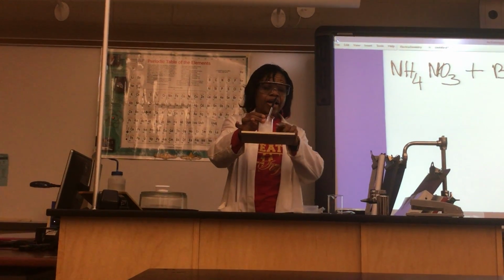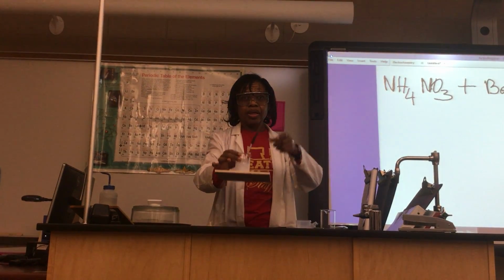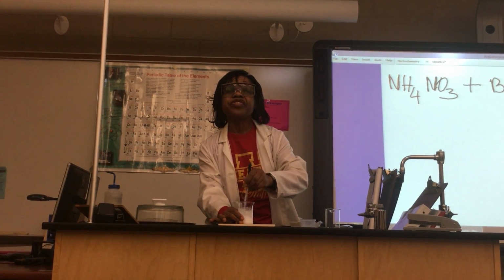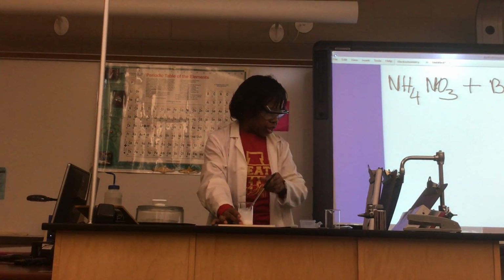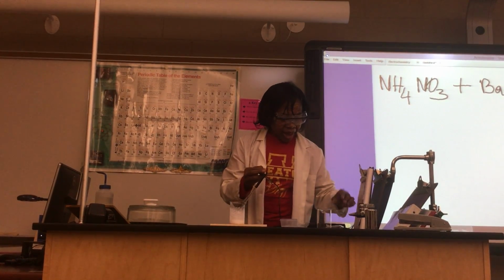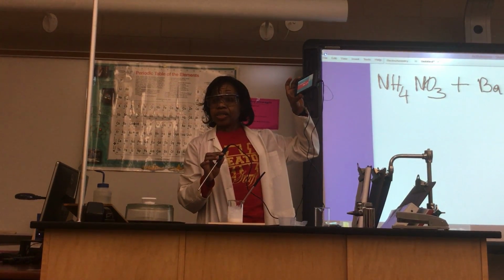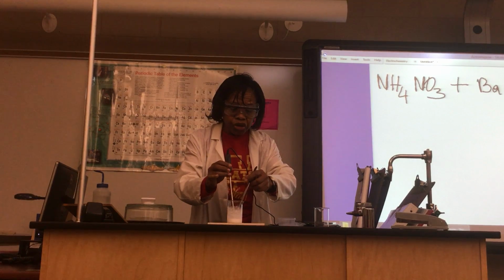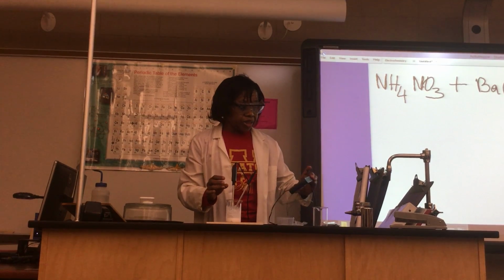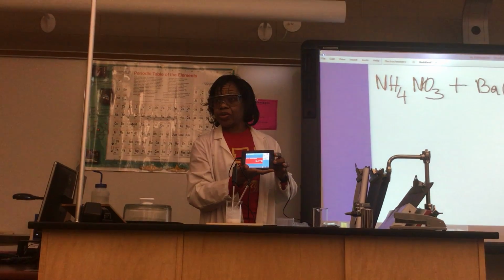Now, do you see what is under the beaker? It is ice. So when you touch it, it is extremely cold. It freezes the water on the wood. So I have my LabQuest ready here with my temperature probe. I'm going to take the temperature. Now it says this is room temperature. It is 25 degrees Celsius. Okay, I'm putting it in the solution right now, and we are going to read the temperature. Give it a few seconds, so it completely goes down, going lower than 0.